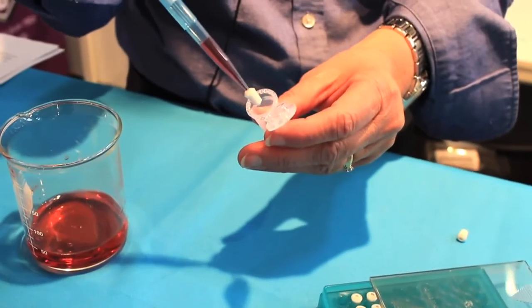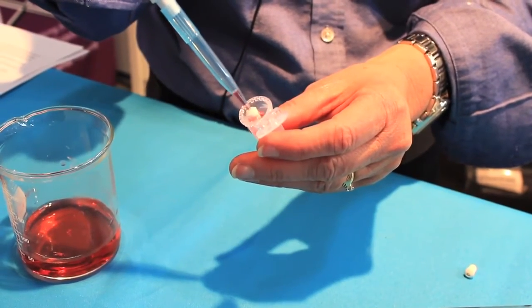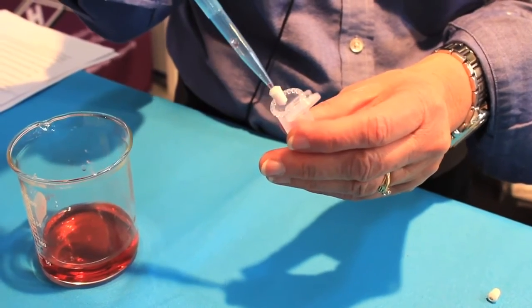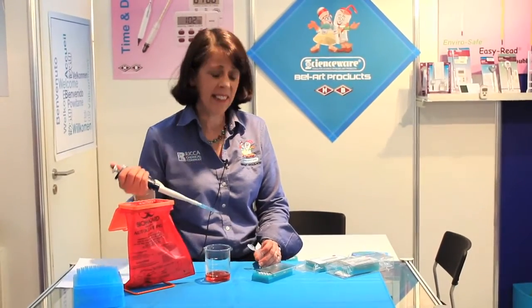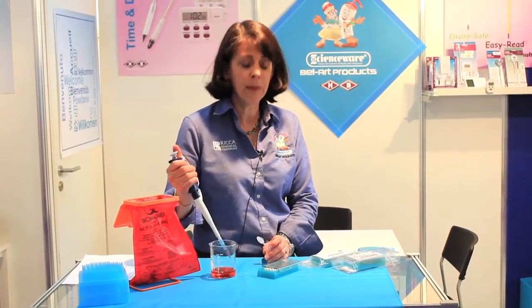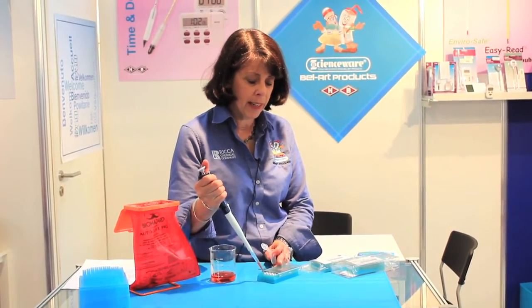FlowMe has been tested with most major brands of pipette tips and found to be compatible with all of them. In addition to on-site field testing, we've also had FlowMe tested in an independent testing laboratory. FlowMe has been found to be extremely effective in filtering out cellular debris and superior in retaining your sample volume and cells.